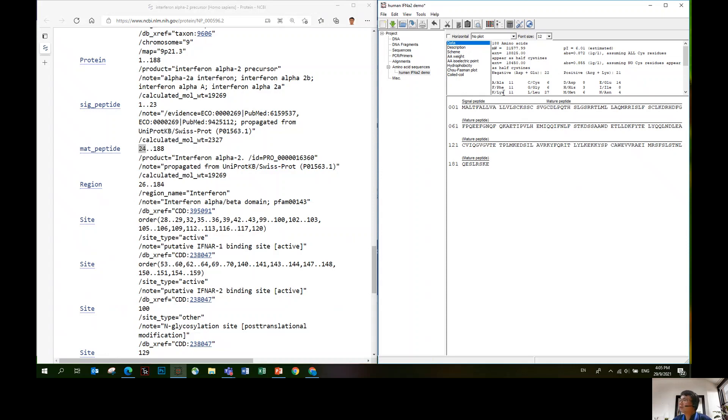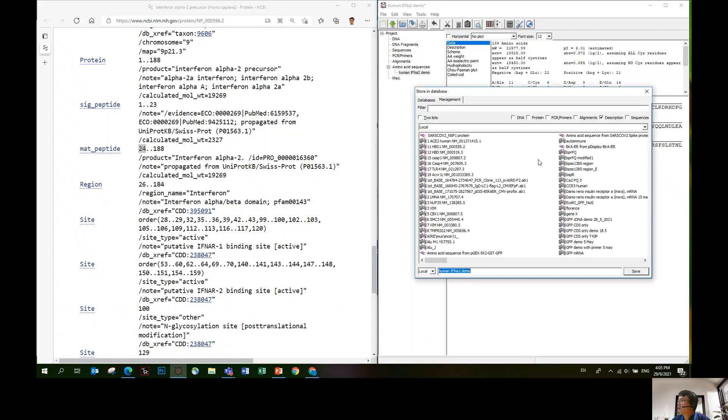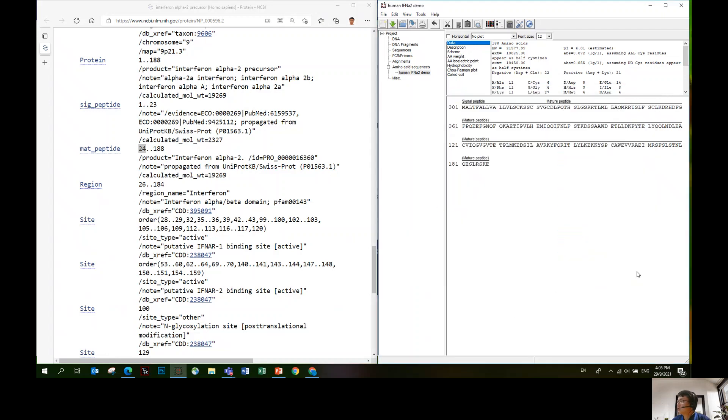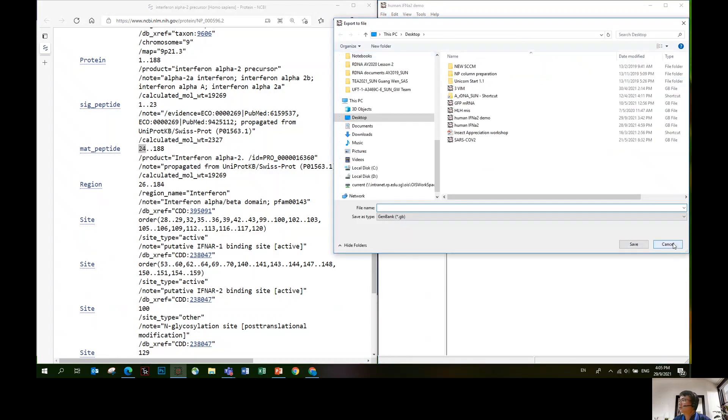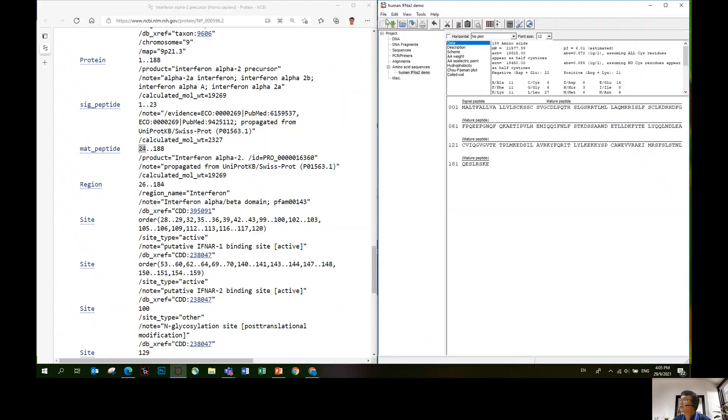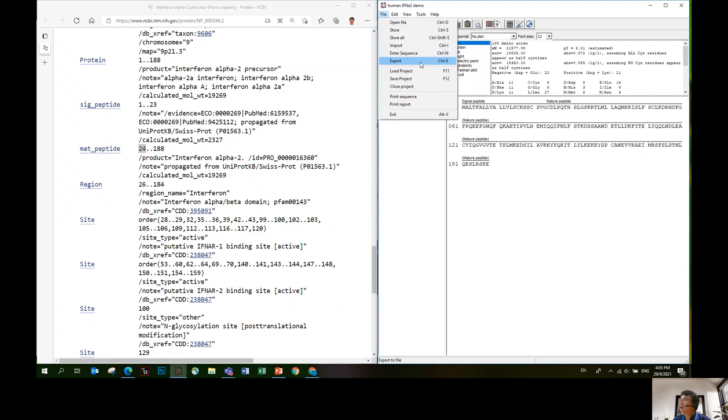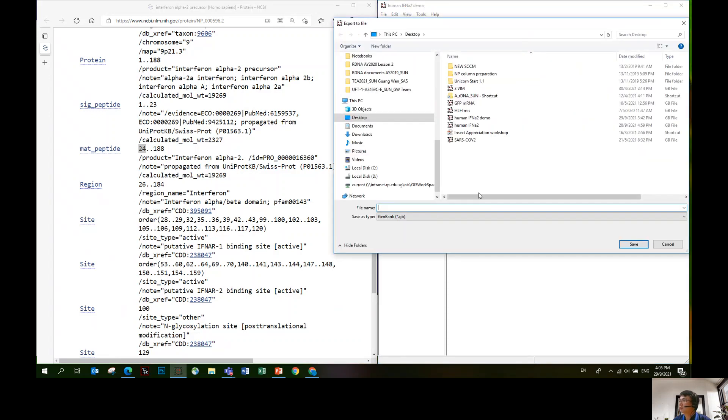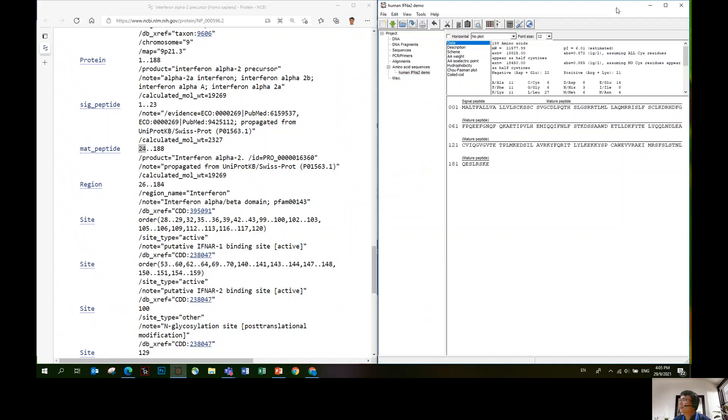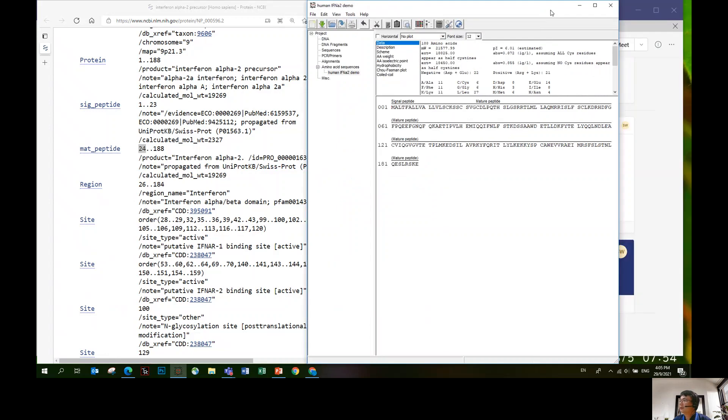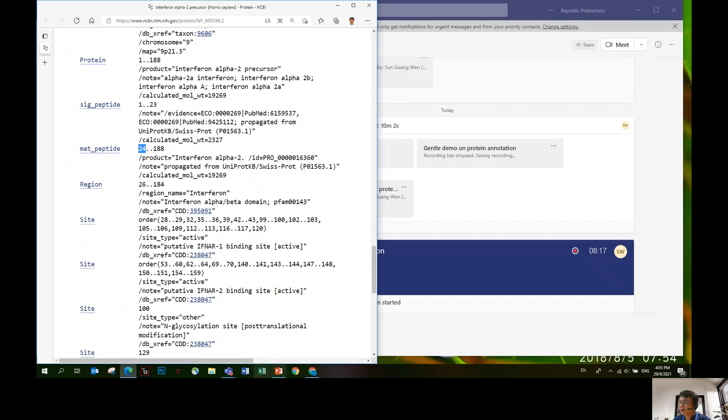That's all we have. Control S to save the sequence and the modification. Then we're done. In order to export, just click control E, or go to file, click export. Here, I've already done a few sequences. I'm just going to replace this one. Now we're done.